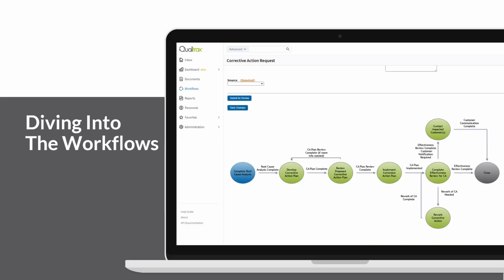What we are doing is just looking at what the standard is asking for and requiring and providing a framework for you to demonstrate that. In most of these areas, you're still going to have processes and procedures and policy that you write. And our workflows should be designed to fit into that and adaptable to that. So keep that in mind. Everything you're seeing here can still be edited and changed by you and made to work within your process.